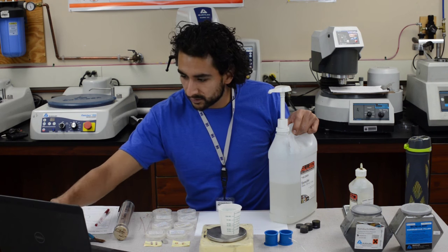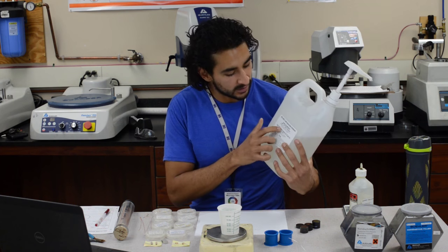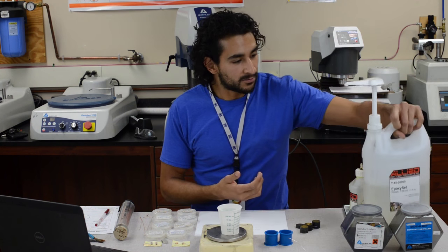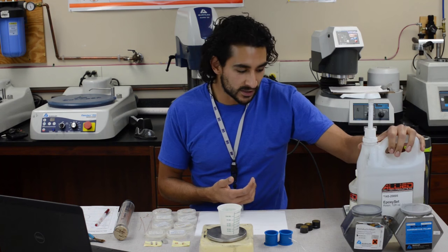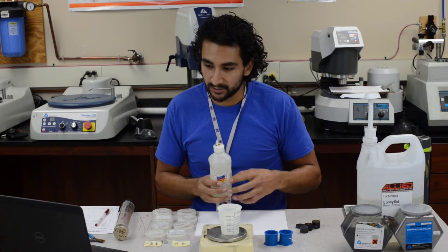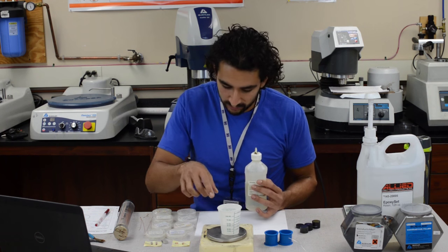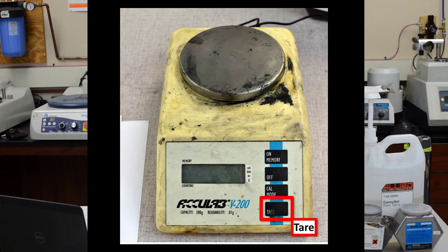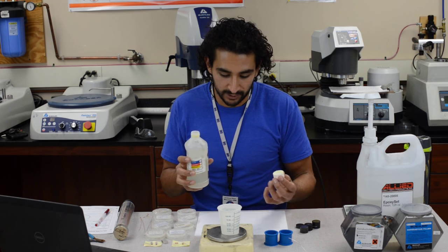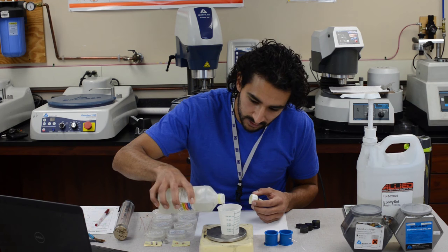50.23 grams. In this case, this particular epoxy has a ratio of 100 to 12, resin to hardener. So however many grams I add of the resin, I multiply that by 12 and divide by 100 to get the hardener amount — that gives me 6.02 grams. So I'll tare this again and add my 6.02 grams of hardener. You don't need that much.